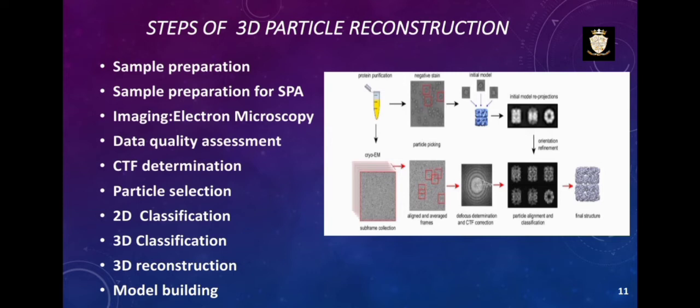So, sample preparation, imaging in the electron microscope, data quality assessment, CTF determination, particle selection, 2D classification, 3D classification, 3D reconstruction, model building. These are the steps involved in single particle reconstruction.